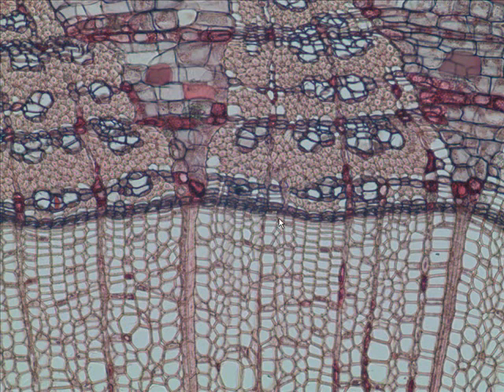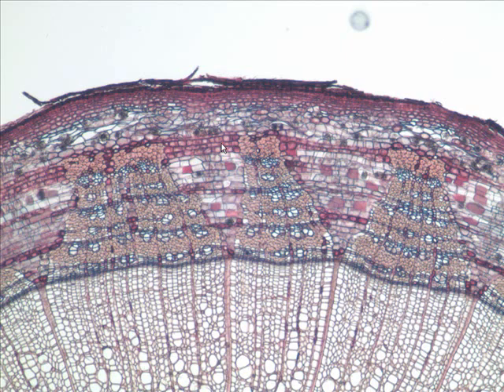We pointed this out before, but now we're up kind of close and personal. What is this layer of cells, this darkened layer of cells right here? It is what? The vascular cambium, making what to the inside? Secondary xylem. What to the outside? Secondary phloem.